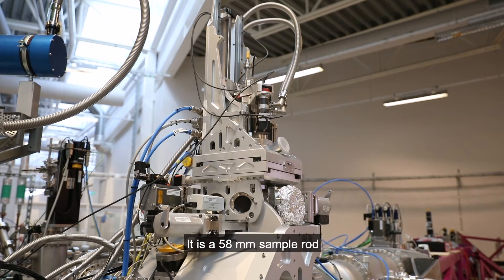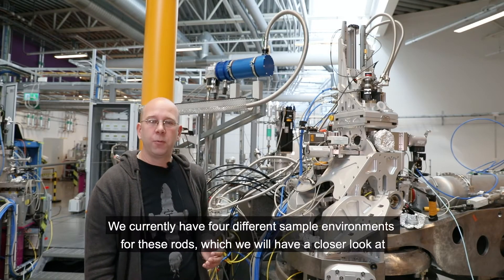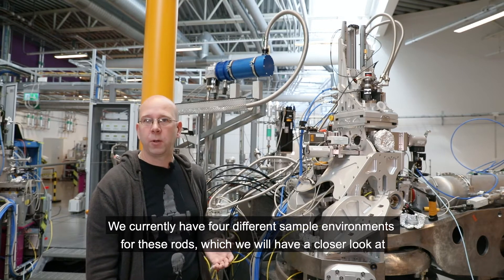It accepts a 58-millimeter sample rod attached to a CF-63 flange. We currently have four different sample environments for these rods, which we will have a closer look at.